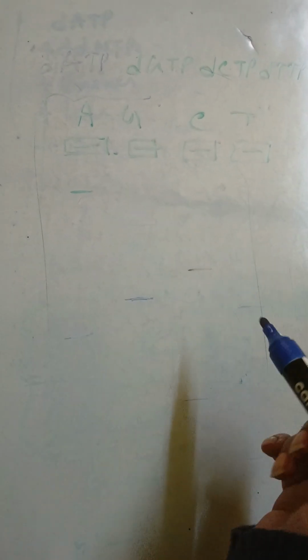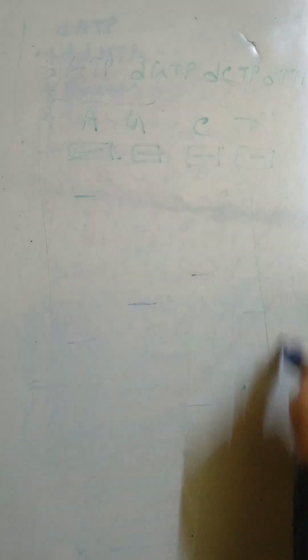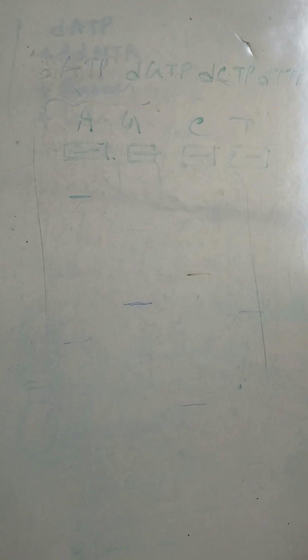You put your samples into the lane at which the wells are made, and you will get the gel bands accordingly. It's not like you will get the bands of C at the lane of G. No, it's not like that. You will get the bands of C according to its lane. They will not be mismatched. So that is the beauty of gel run or gel electrophoresis.